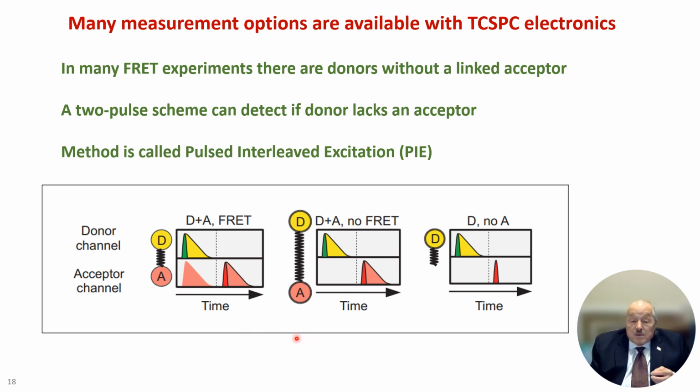So it should be visible if you give a second longer wavelength pulse just to check if the acceptor is there. This is exactly what's being done by one of the companies. They get their donor, they know they have a donor photon, then they look and see if there's an acceptor there, so they put in a longer wavelength pulse, and if there's no acceptor, they don't count that as one of the FRET measurement pairs, so you could reject those donors that didn't have an acceptor nearby.